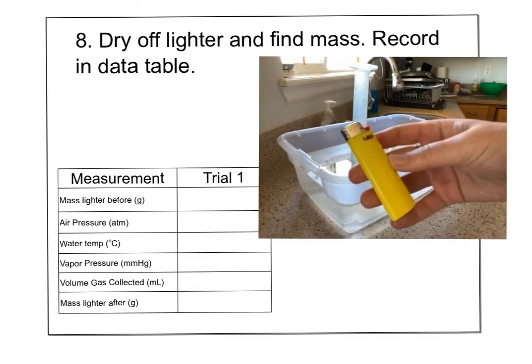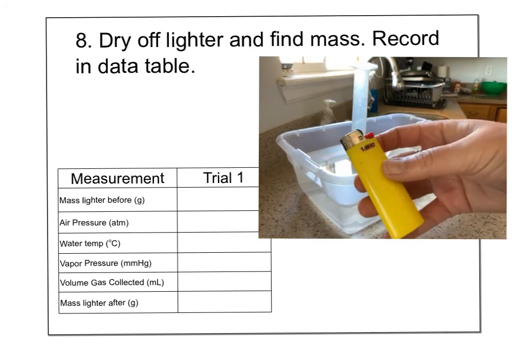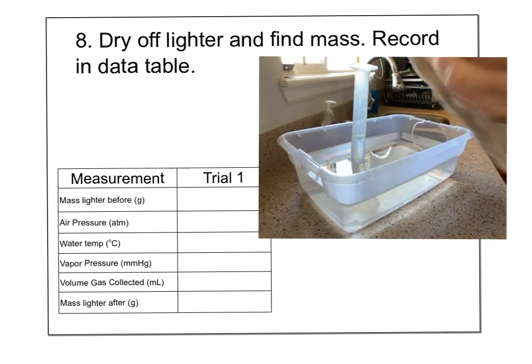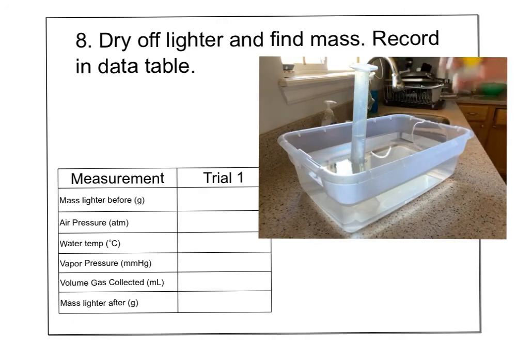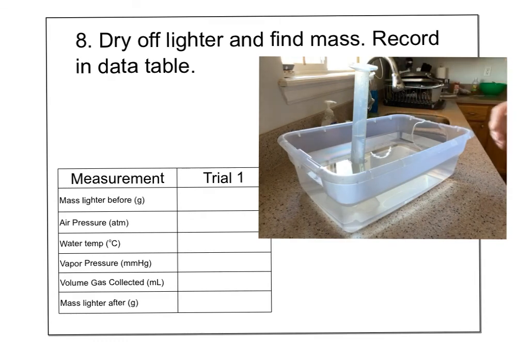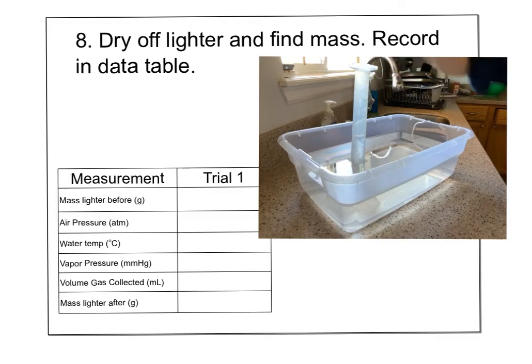Now I need to find the mass of the lighter, but it's dripping wet with lots of crevices. I'm going to dry it carefully with a towel — without pushing the button so we don't lose more gas — and shake it to get as much water out of all the crevices as possible, since water droplets could mess up our measurement.